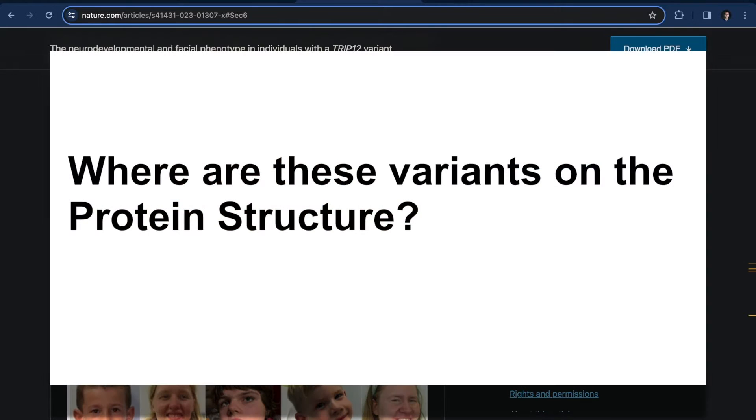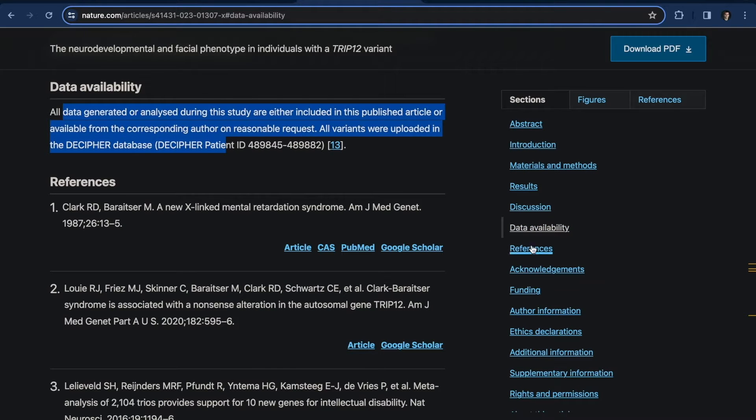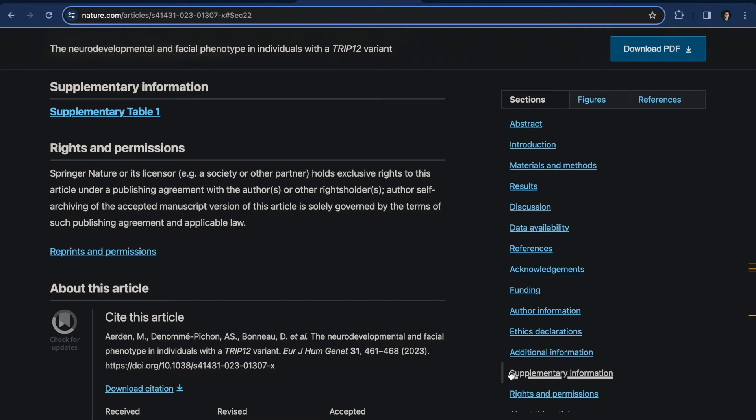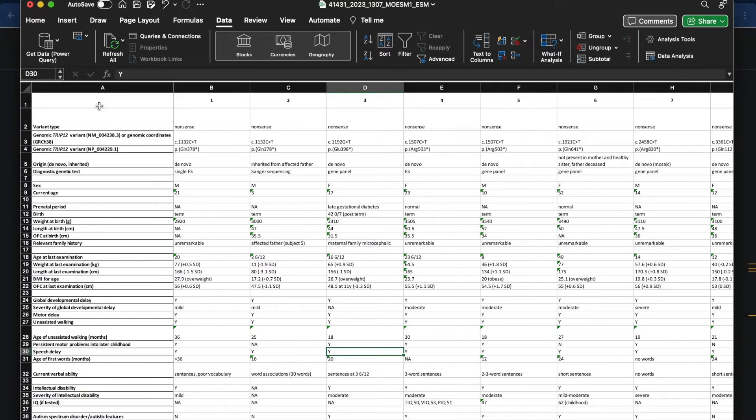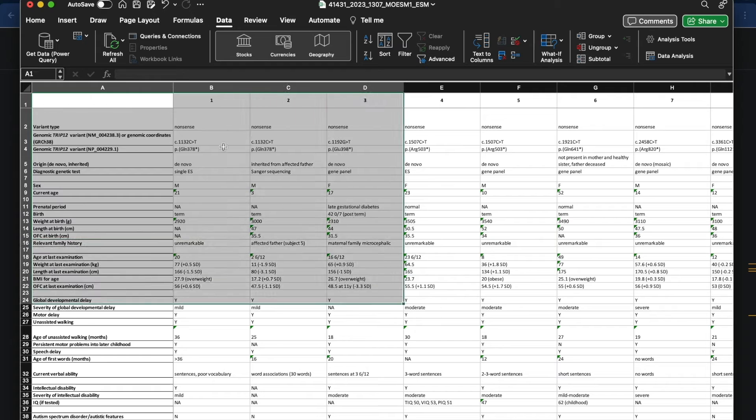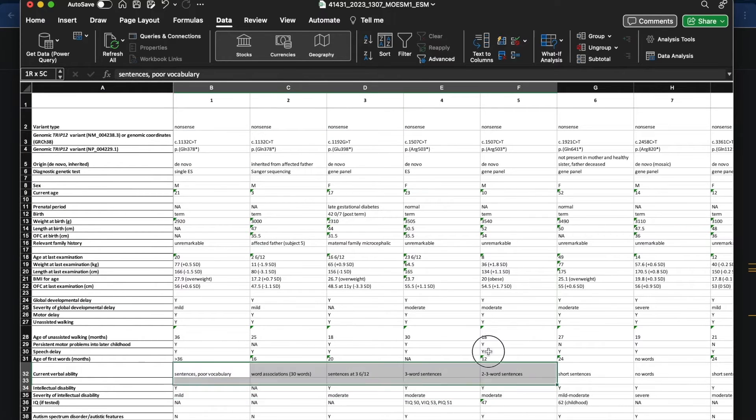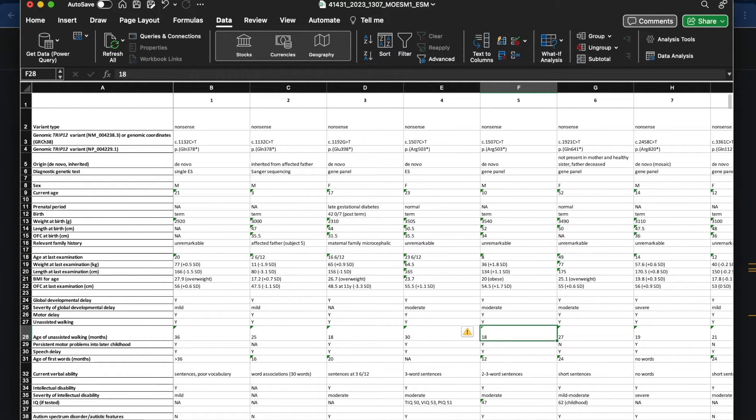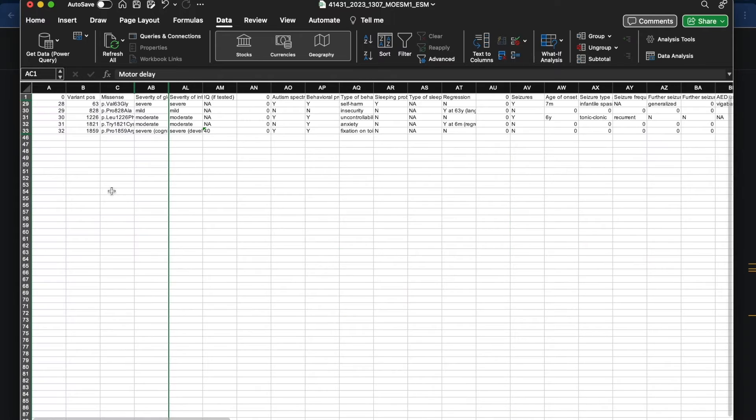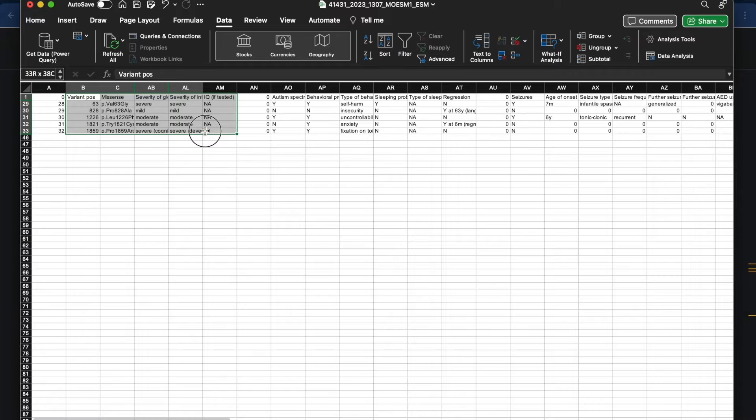So our first question is, what are these variants on the protein structure? It's super convenient. I can scroll down in the paper, and I can see in the supplemental data section all of the authors' data. They attached the variants they found and a lot of different phenotype data that they gathered across all of the different patients, which is also going to be useful for us, so we can look into different trends on the protein structure. So I pulled out a few missense mutations, and we'll take them over to G2P to analyze.